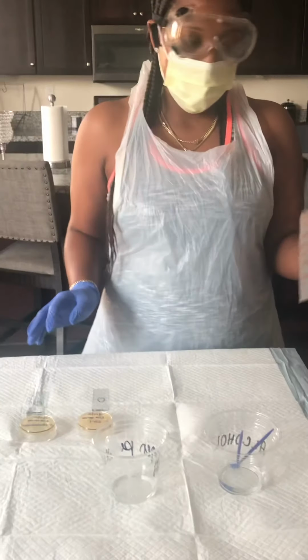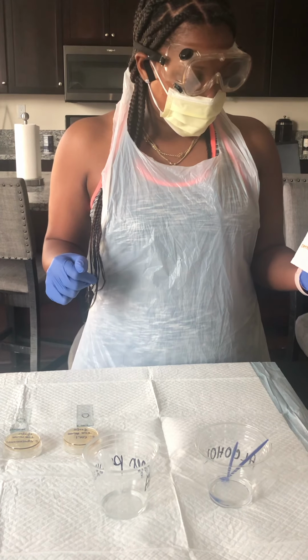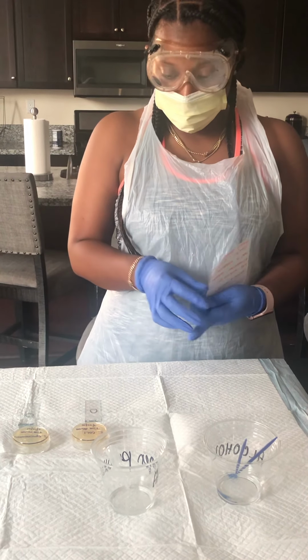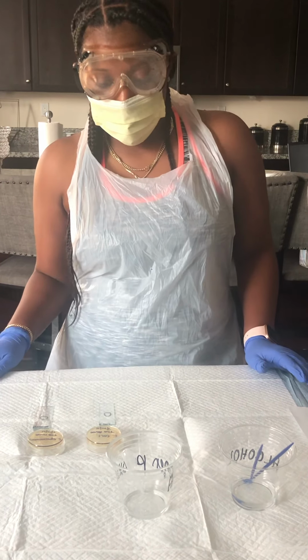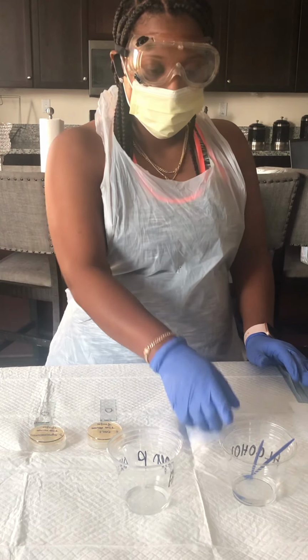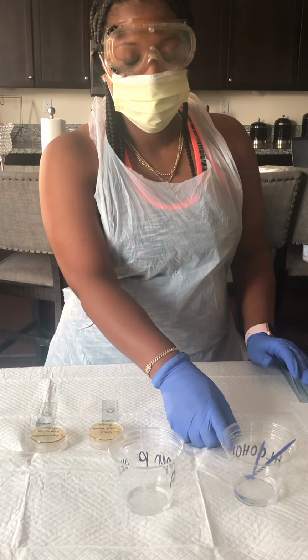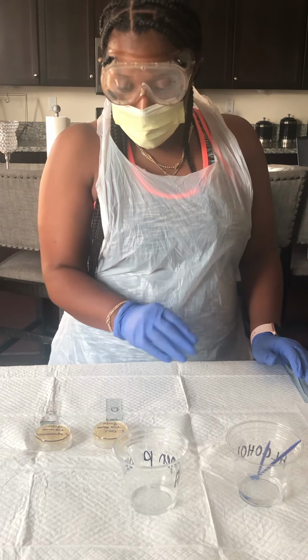This is lab 6, exercise 2. This is the biochemical testing for microbial identification, the catalase testing here. So once again, I sterilize my area. Of course, I have my PPE on. Here I have my inoculation sticks, sterilizing in alcohol, my pipette and my hydrogen peroxide.